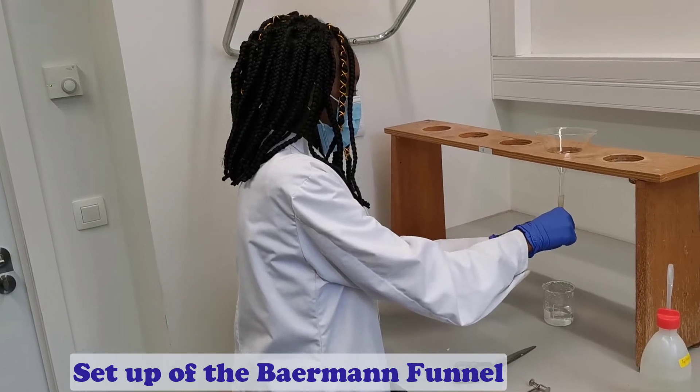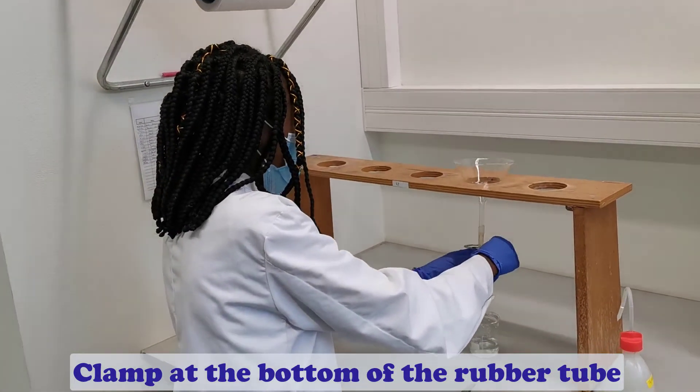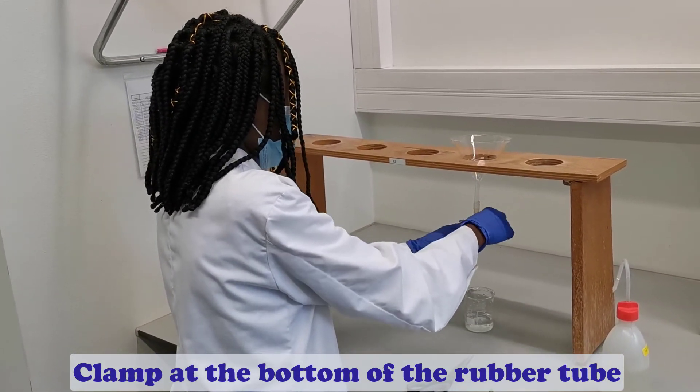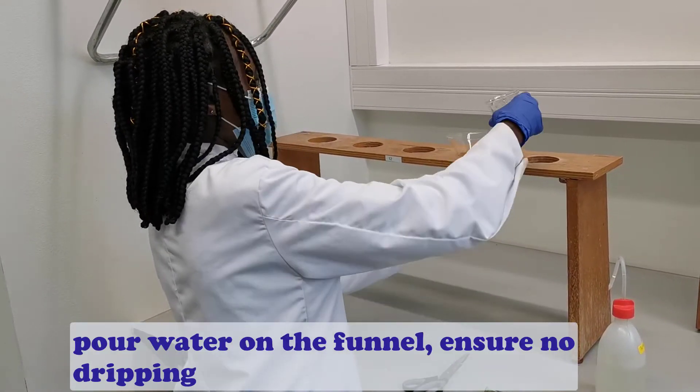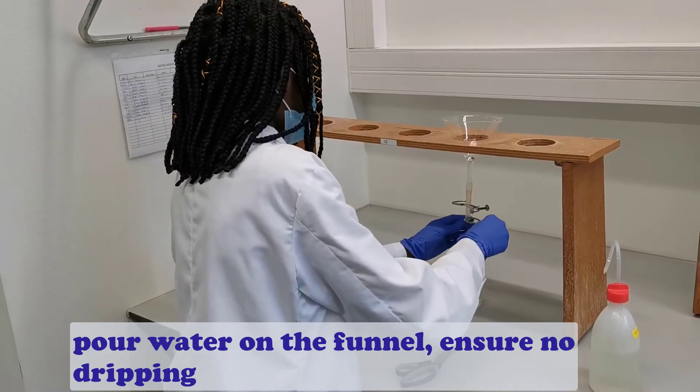We start the setup of the Baermann funnel by clamping at the bottom of the rubber tube. This is where the nematodes will swim and settle, so ensure it is tightened. We pour some water into the funnel and ensure there is no dripping.